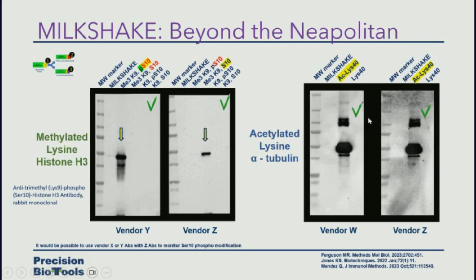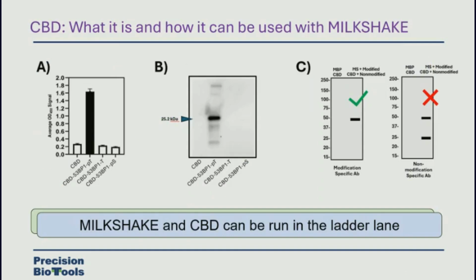This is acetylation. I will say, for some reason, acetylation, I don't think we've ever found a bad acetylation antibody. So if you're working in acetyl groups, it's nice.